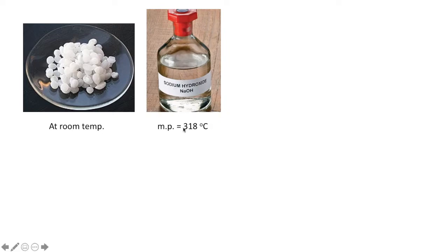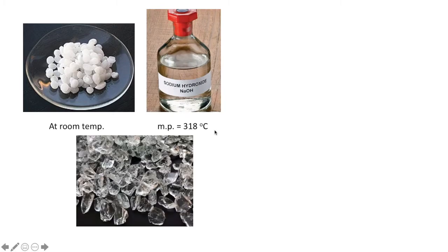However, sodium hydroxide is a very strong base and therefore very corrosive to some metals like aluminum and zinc, tissue, and other materials like glass. Let's focus on glass.